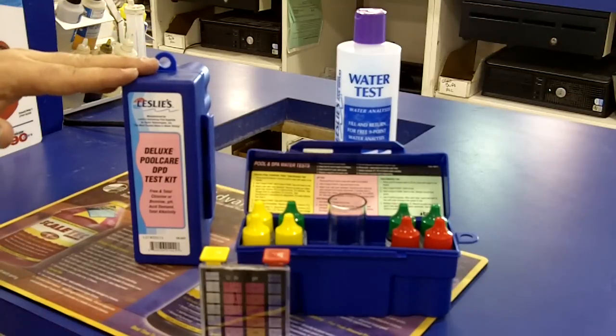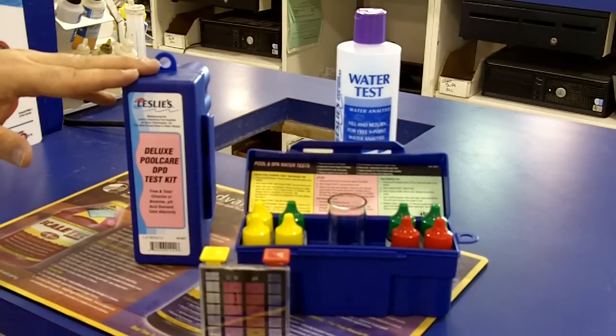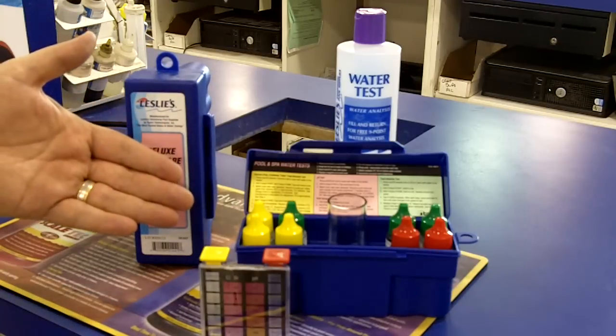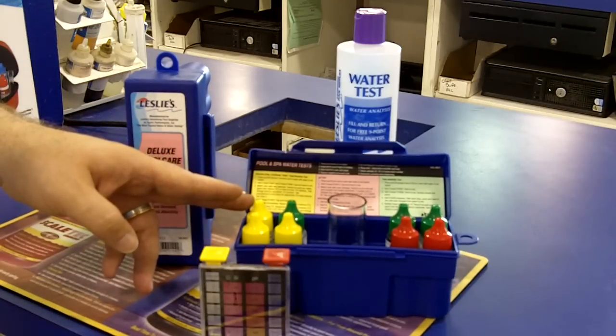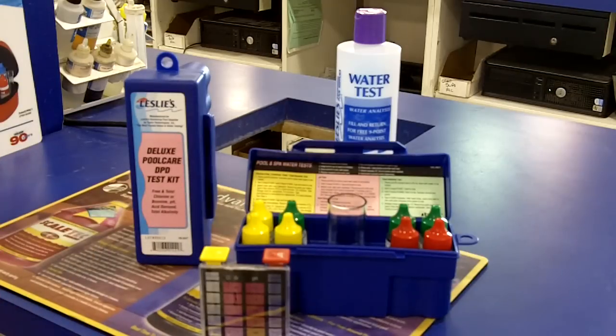We recommend the DPD Deluxe Test Kit from Taylor. It's the perfect test kit for people who want to test their water at home. It has enough supplies to last a year and it includes a simple waterproof instruction card. When you're not using the test kit, store it in a cool dry place — that helps keep the equipment and reagents in tip-top shape.